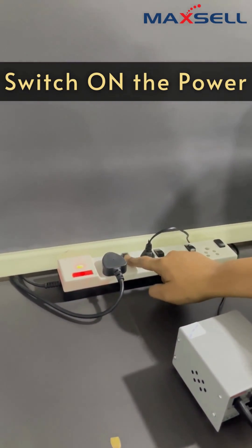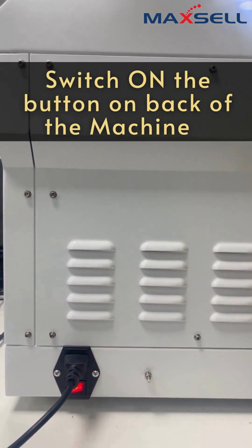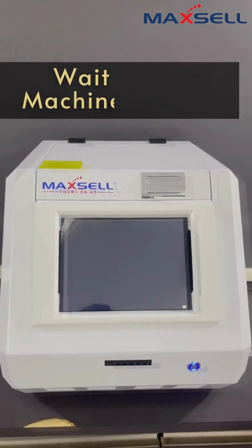Plug in the machine and switch on the power. Turn on the switch at the back of the machine. Wait for the machine to turn on.